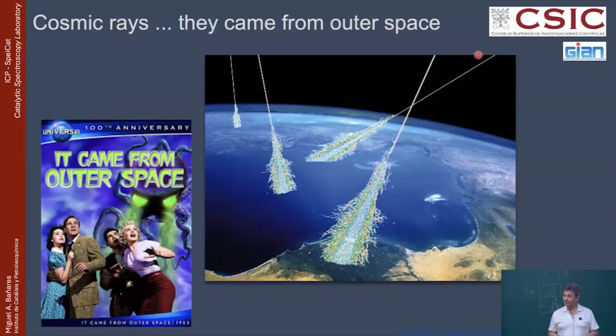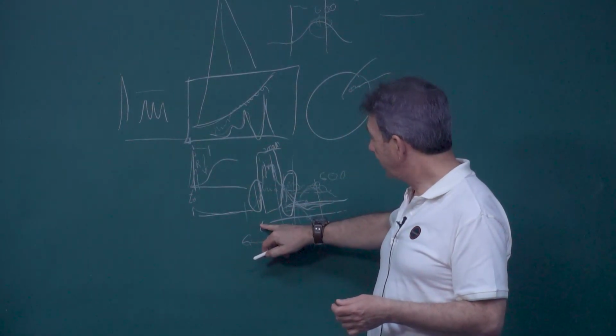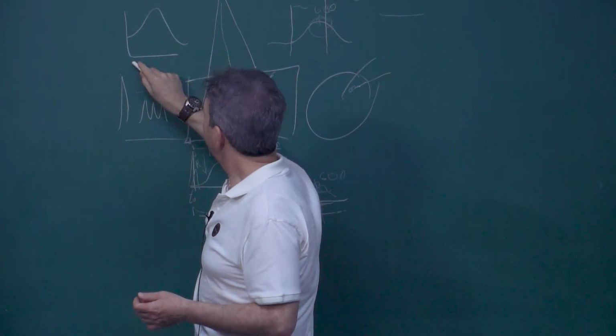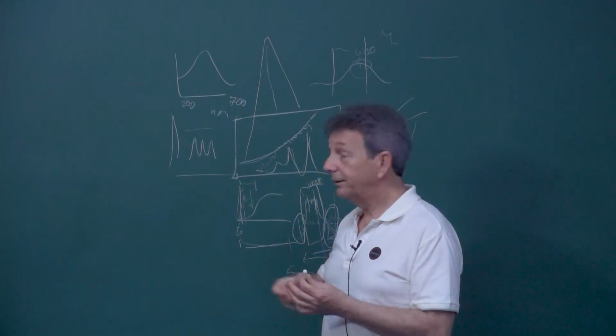What is DRS PL and how is it different from UV spectroscopy? DRS is diffuse reflectance, and PL is photoluminescence. In UV spectroscopy, you are absorbing radiation. You use different wavelengths and measure, for example, from 200 to 700 nanometers. I'm left-handed, that's why it looks awful.